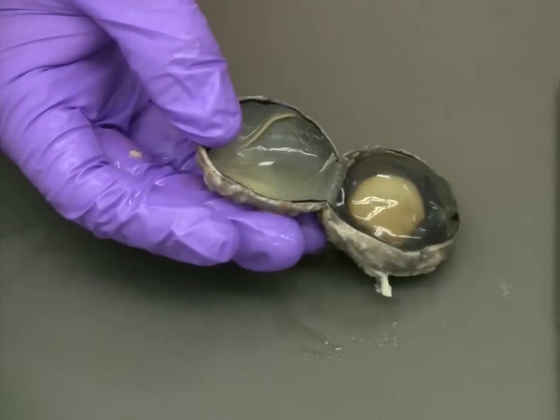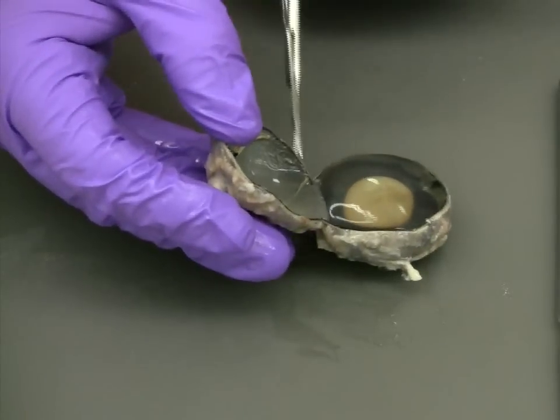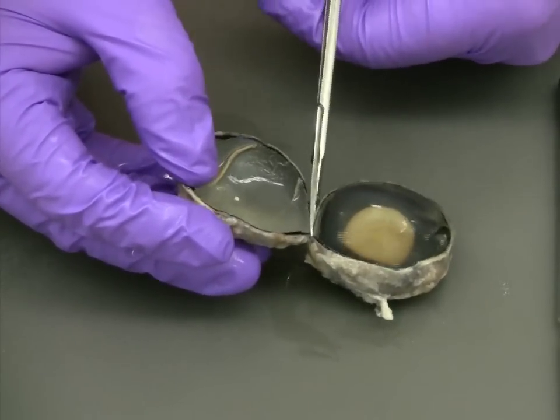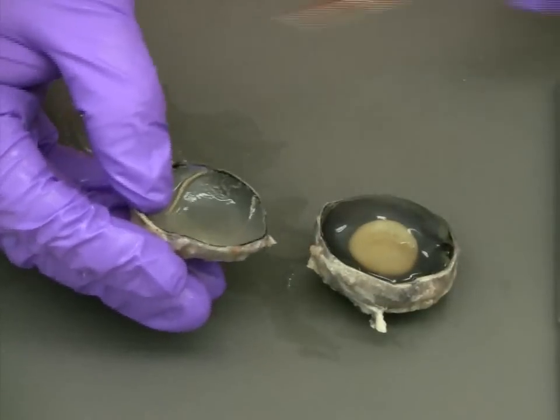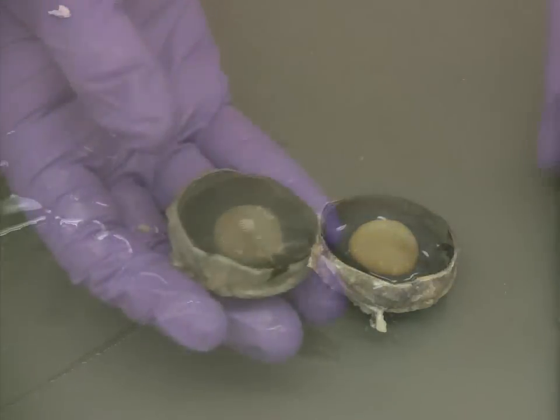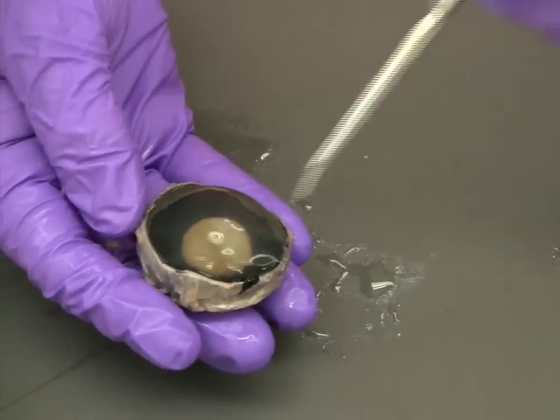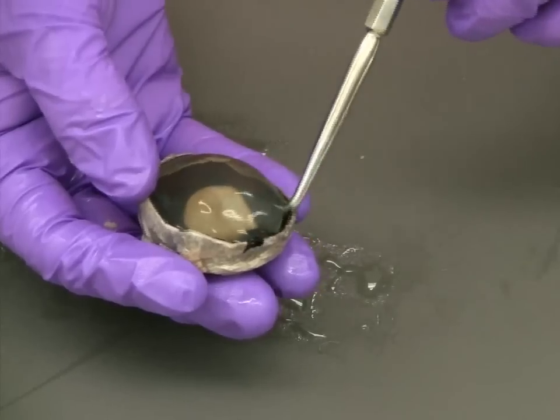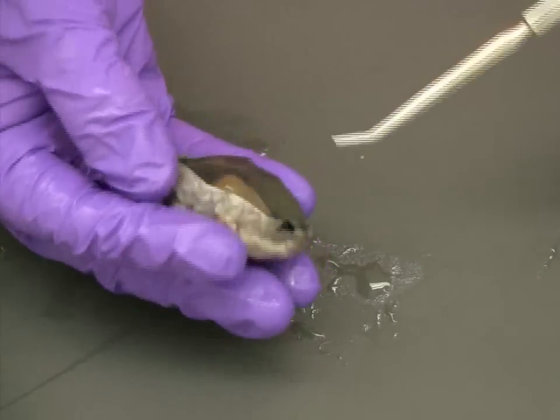Now you can finish the incision you started to gain access to the eye. And once that's complete, we can begin removing the vitreous humor from around the lens and iris. To do this, you can carefully use your blunt probe to loosen the connection between the vitreous humor and the rest of the eye.